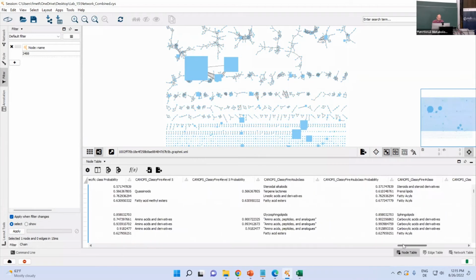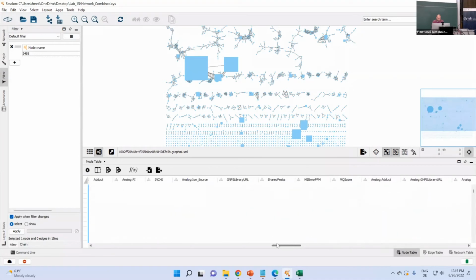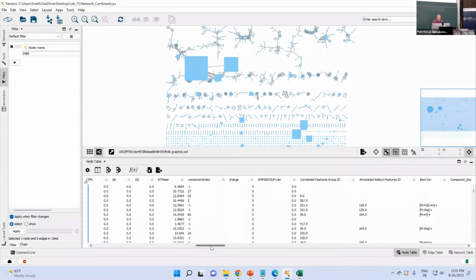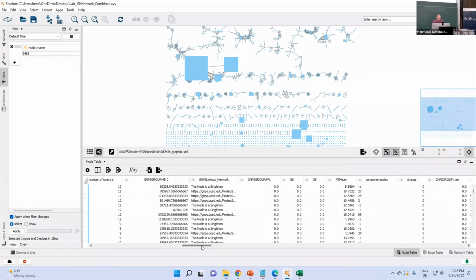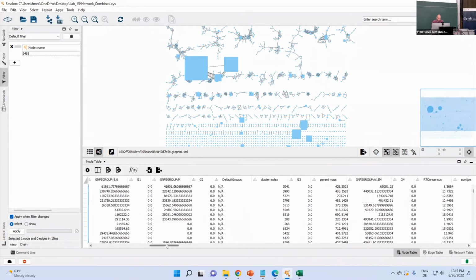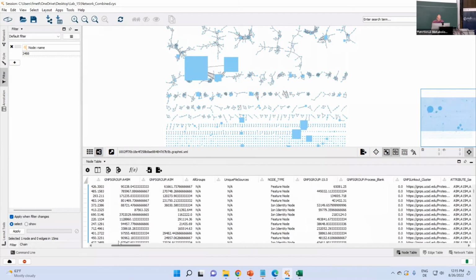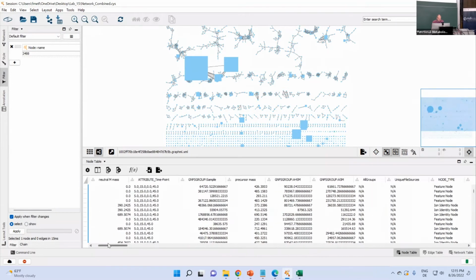And now I just go all the way till I get to the library names. So that should be compound name also.